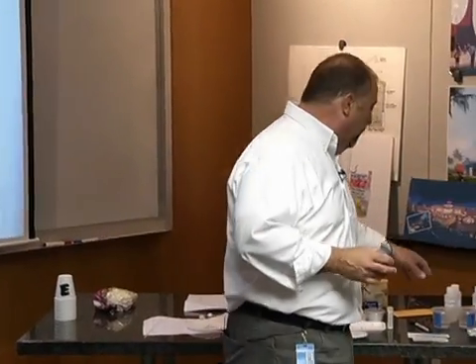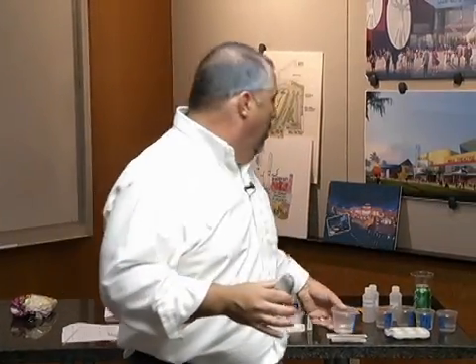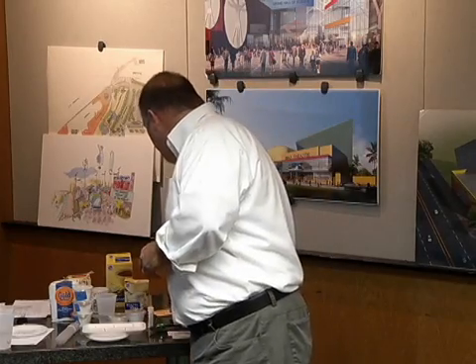Now, what we're going to do is we are going to test some liquids. Now, just like before, around the room I have these cups labeled 1, 2, 3, 4, and 5. In a minute, you are going to go around and we are going to check to see what kind of pH level these things have. But to do that, we have to find some way to figure that out, because all these chemicals are clear, colorless chemicals. So what we're going to do is use a way to measure that. Now, we can measure it in different ways.